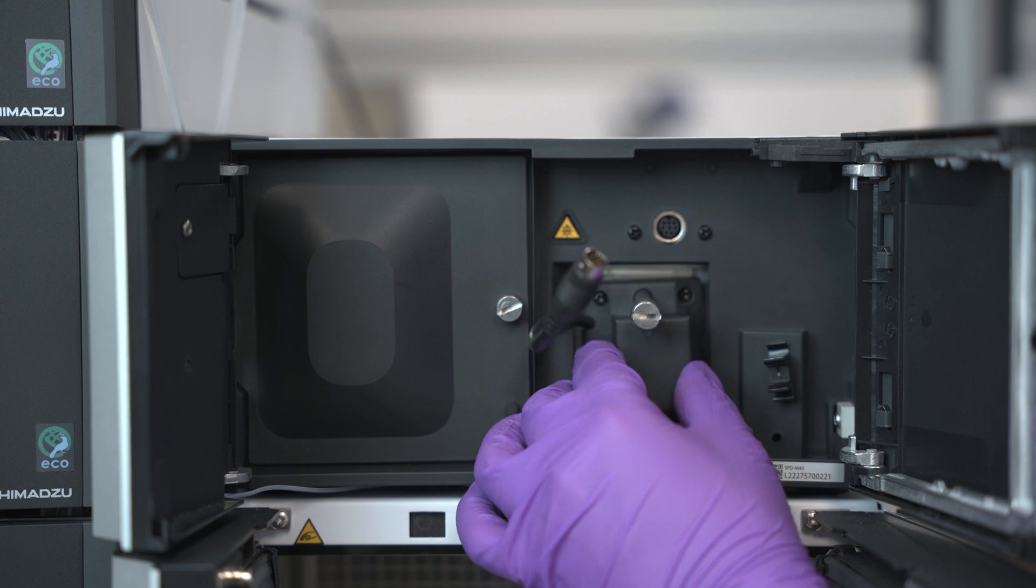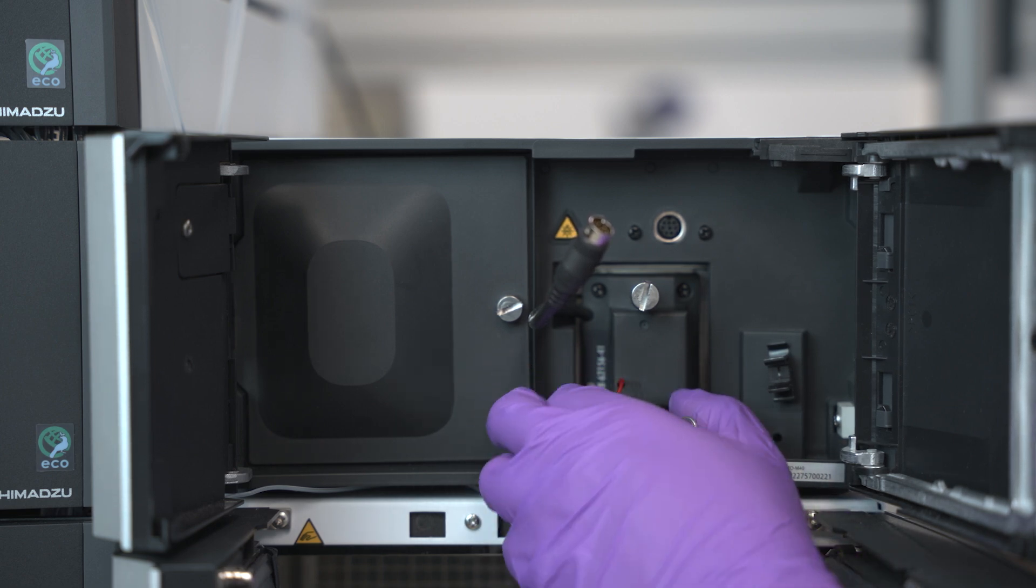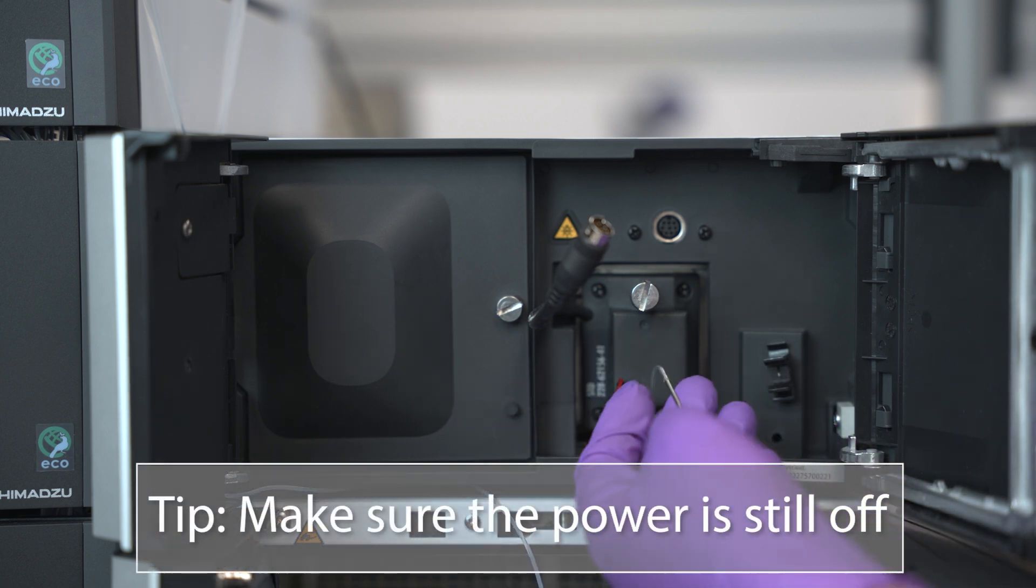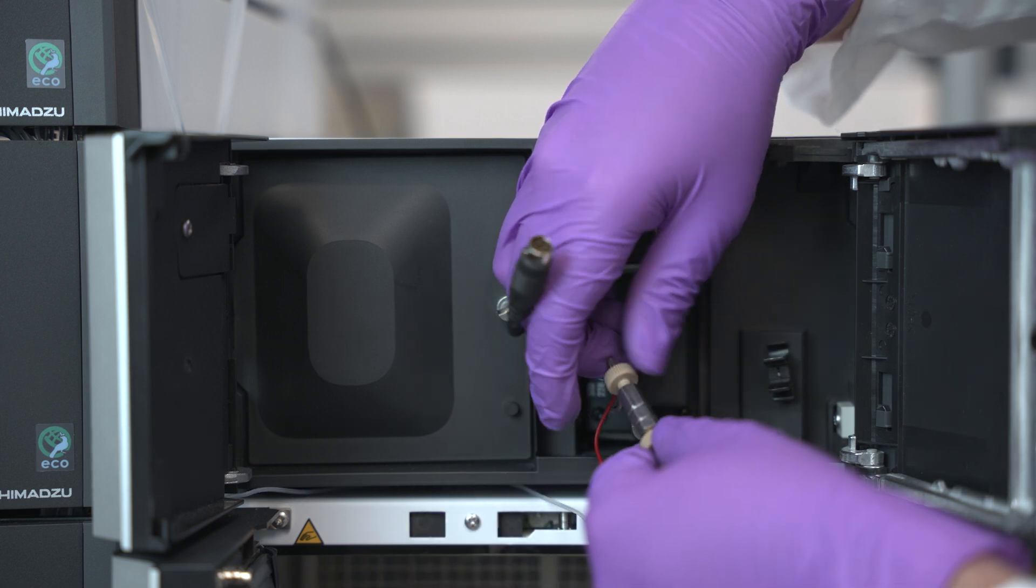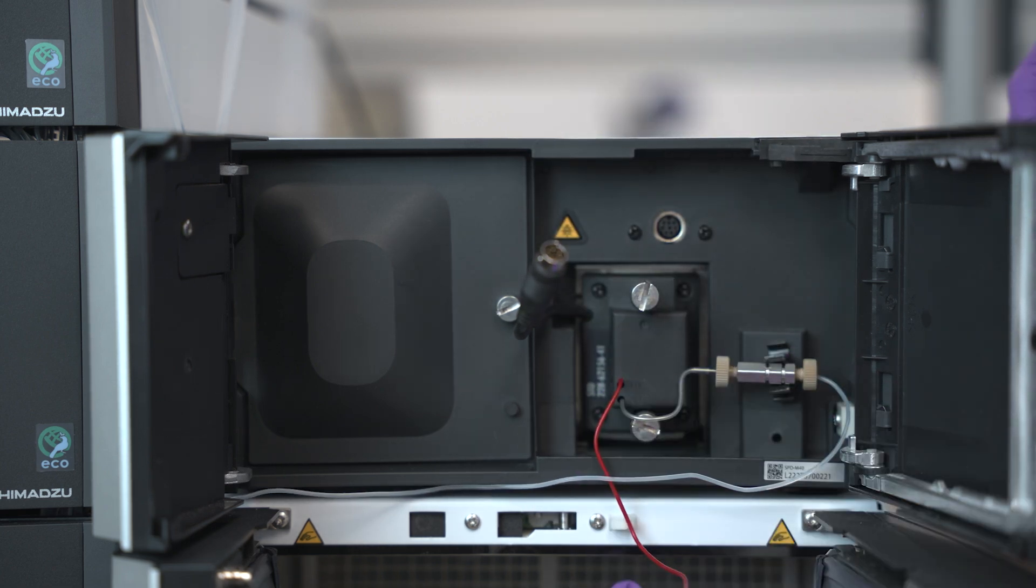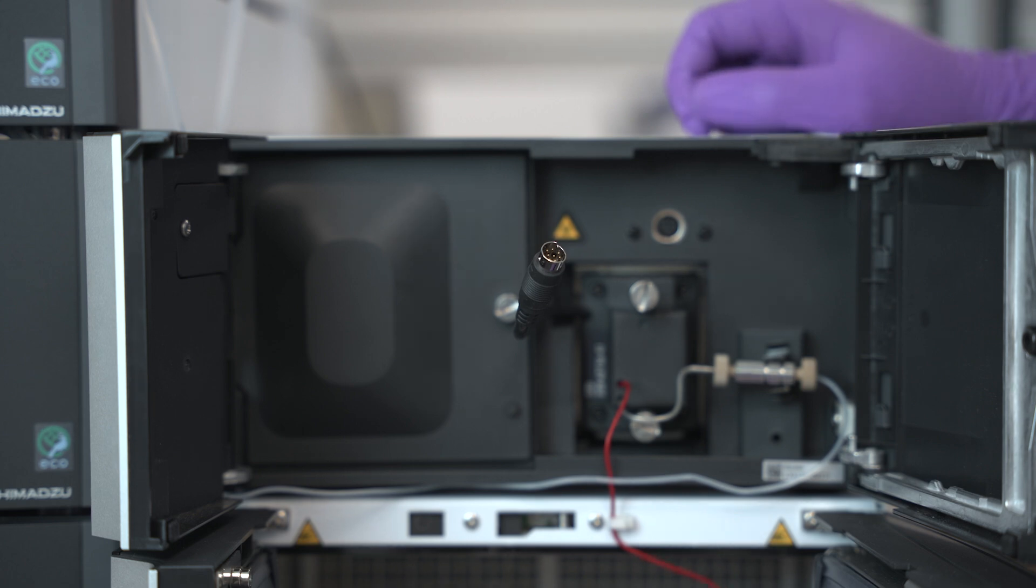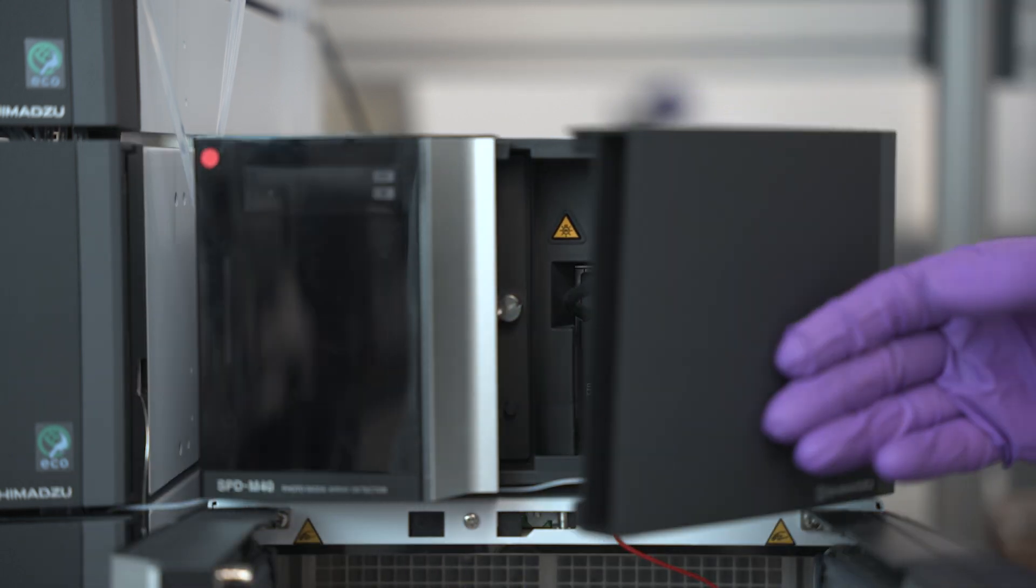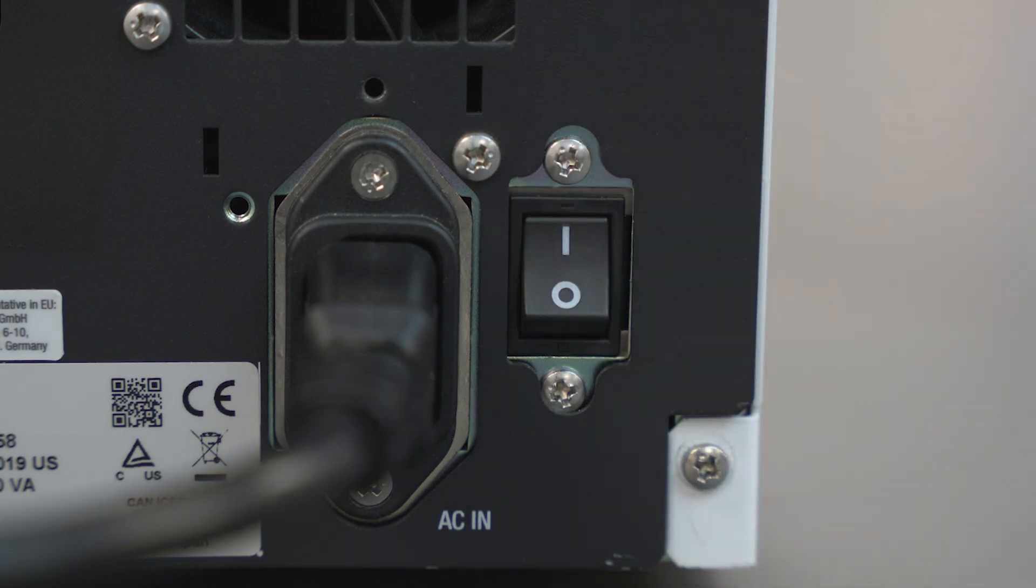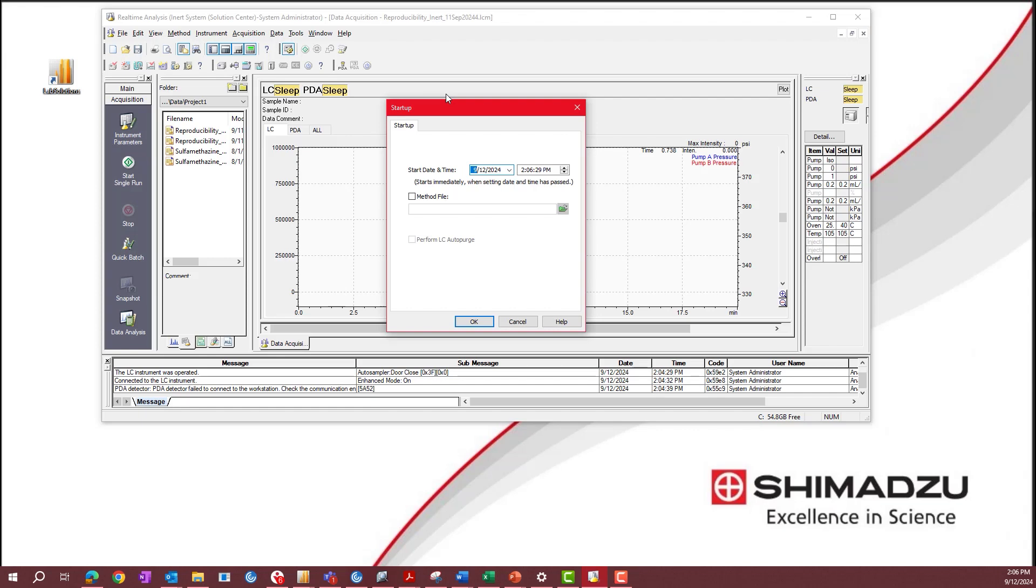Insert the flow cell into the detector. Hold the flow cell in place while you tighten the two cell mounting screws alternately. Make sure the main power is still off. Attach the inlet and outlet tubing to the appropriate unions on the flow cell and fix them to the detector with the coupling holder. Insert the connector into the instrument. Turn the detector on from the main power switch located at the back of the module. Open Lab Solutions and start up the system. Run your startup method and push out the 2-propanol from the flow cell and condition it for your analysis conditions.